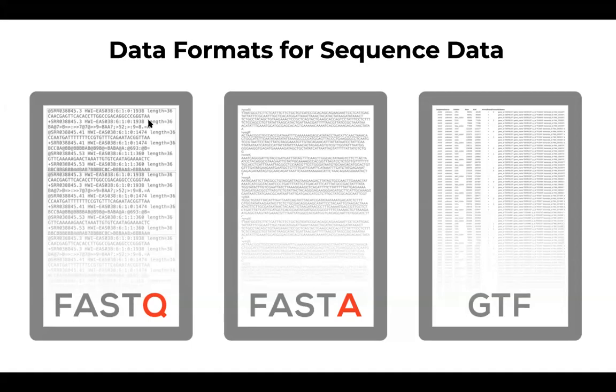We can map them onto known genes, or we can look at alternative splicing, which also comes from the GTF file where many different transcripts are lined out. And we can also detect some novel combinations of exons by doing a more in-depth analysis and identifying junctions between those short reads.